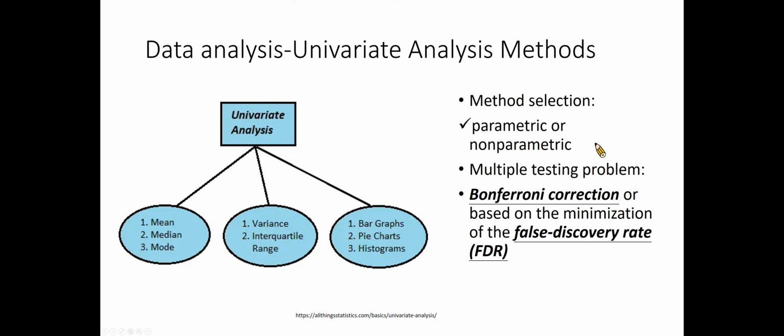The latter can be confirmed using the Kolmogorov-Smirnov normality test or Bartlett's homogeneity of variance test. In those cases where the normality of the data cannot be assumed, non-parametric tests such as the Mann-Whitney U-test or Kruskal-Wallis one-way analysis of variance are preferable.